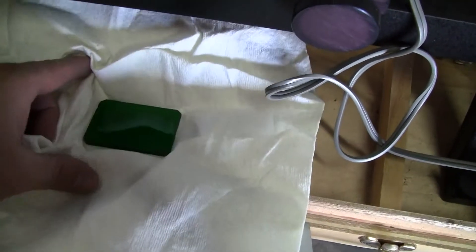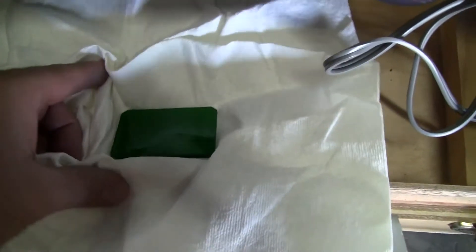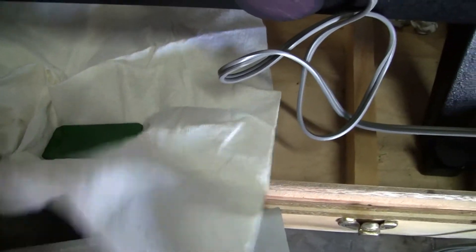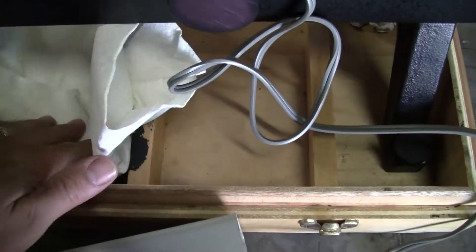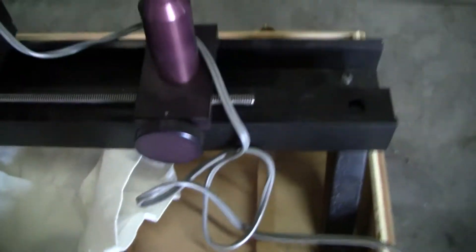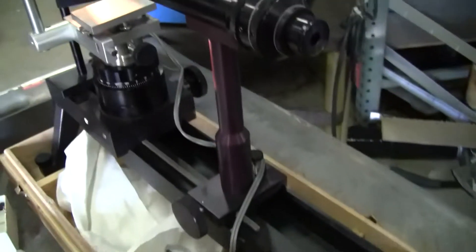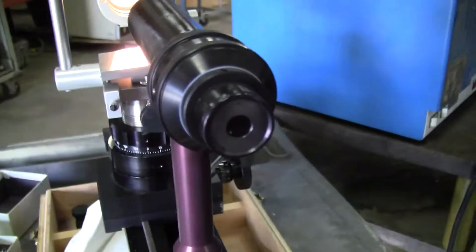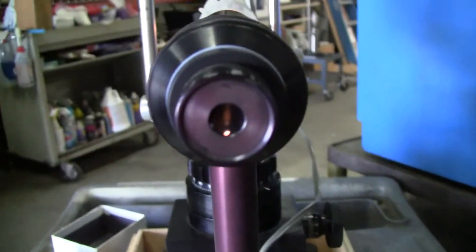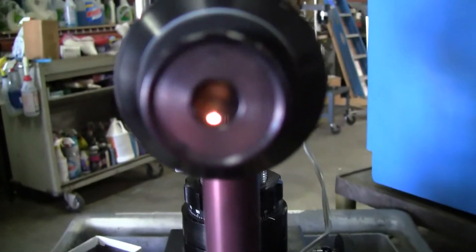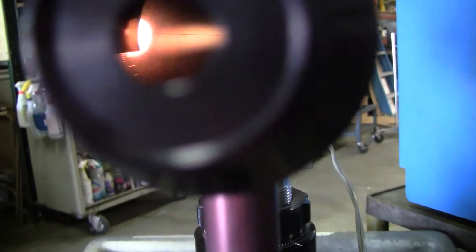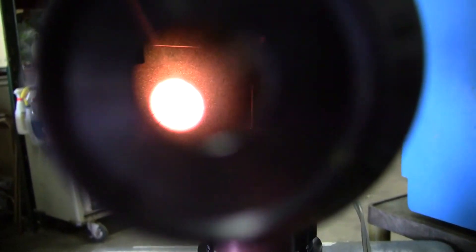Let's take a look at it. Okay. Let's see if we can actually take a look inside. Let's see if this is going to work. Nope.